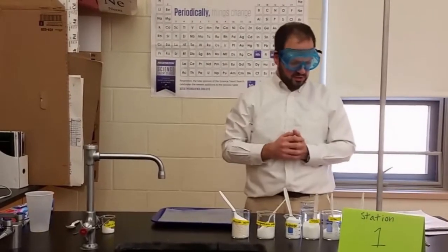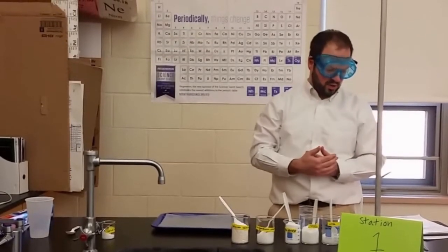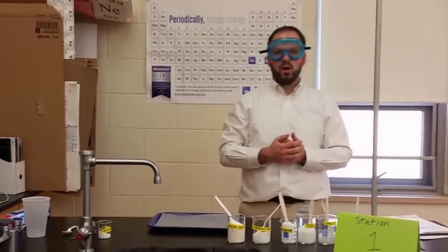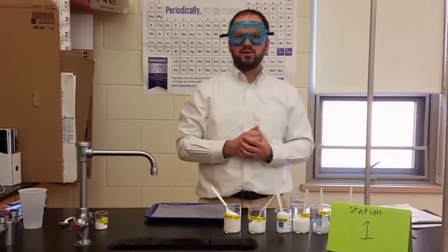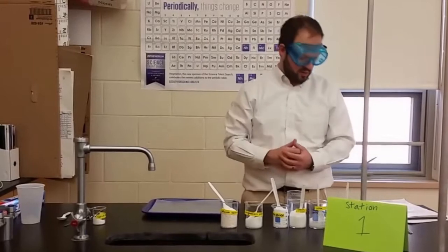Make sure to follow written procedures. If there's a difference between this video and a written procedure, follow the one on the sheet. You also are going to want to make clear labeled data tables as you go along so that it's easier to analyze your data later. Always make sure to write that down.